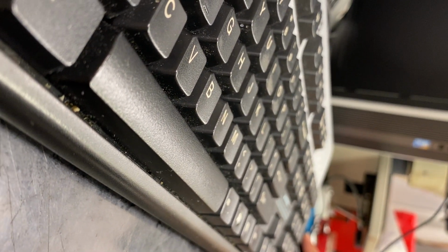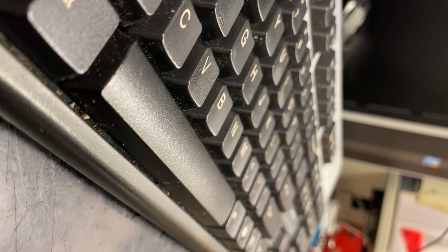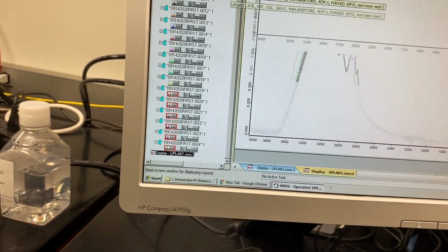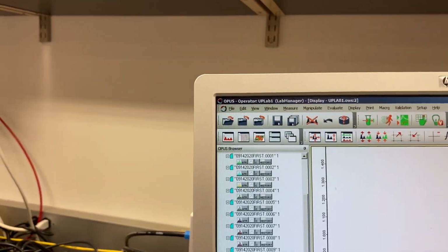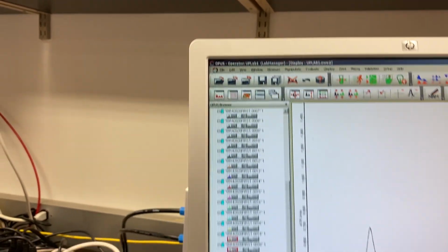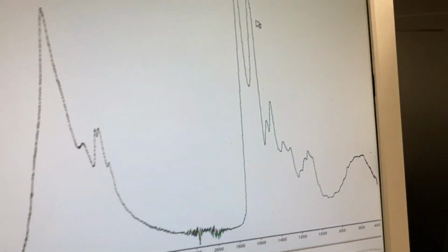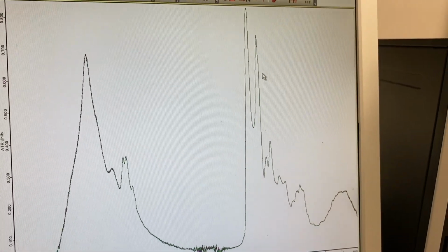So I have to hold control and click 24, 23, 22, 21, 20, 19, so 6 data. I selected them because these are the last ones, and I just open a new page. If you click here, you get the new page, and put the selected data here so that I can highlight them. If you look at them, everything is overlapping here. These are exactly one above the other.